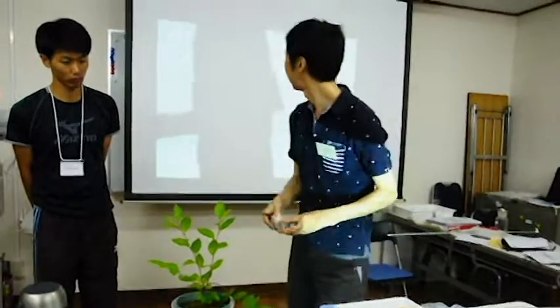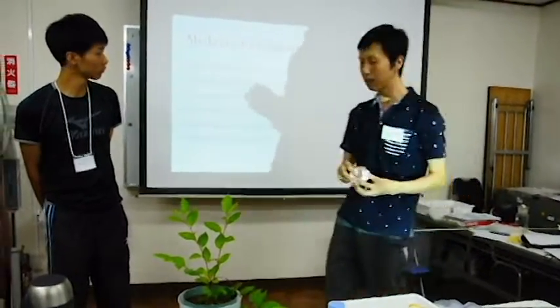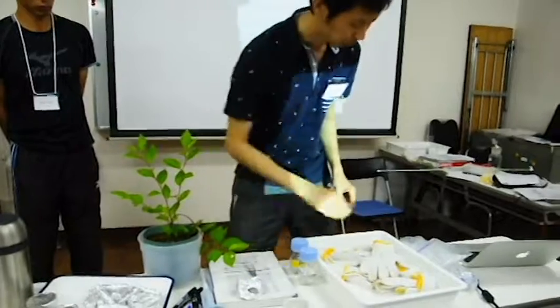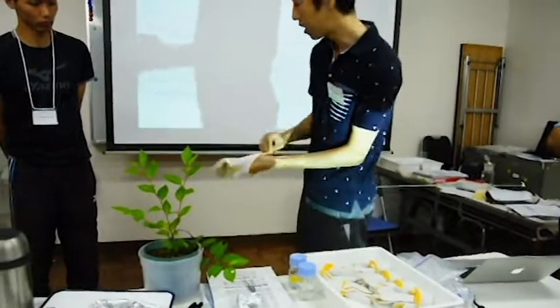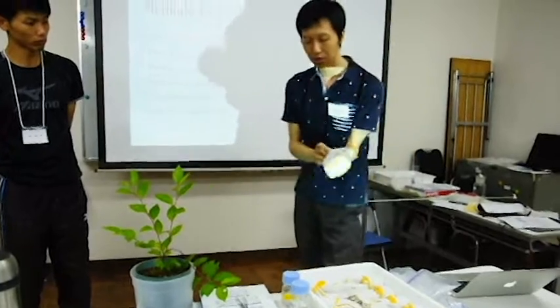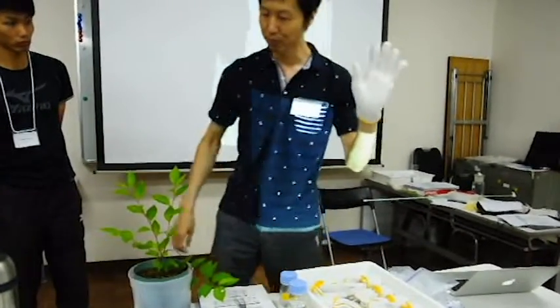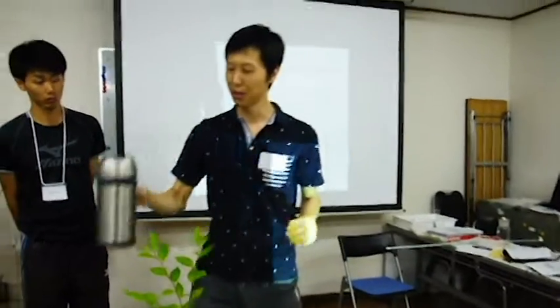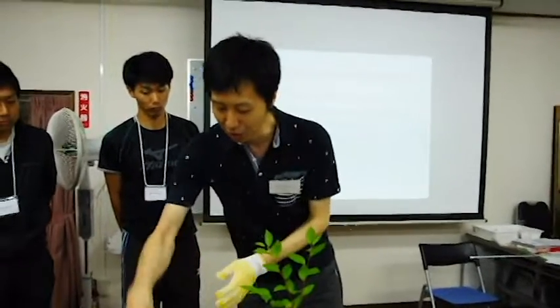This is leaf disc. If you sample leaf disc, please be sure to record the fresh weight of this, right? And then powder the leaf disc in liquid nitrogen. When using liquid nitrogen, please use these gloves, because liquid nitrogen is so cold. That's why, don't touch, don't drink.